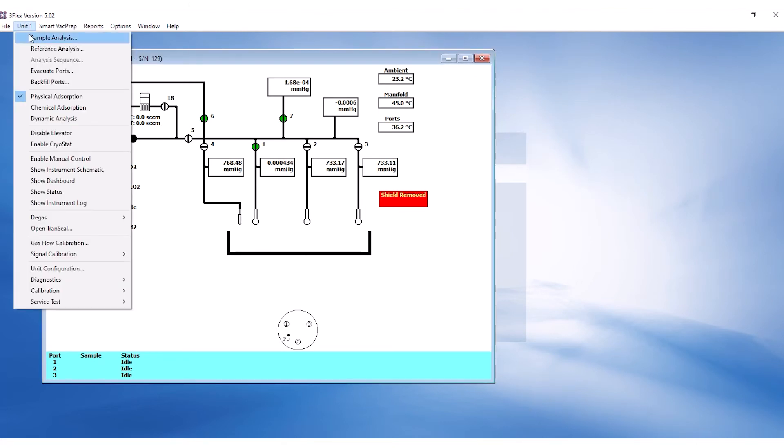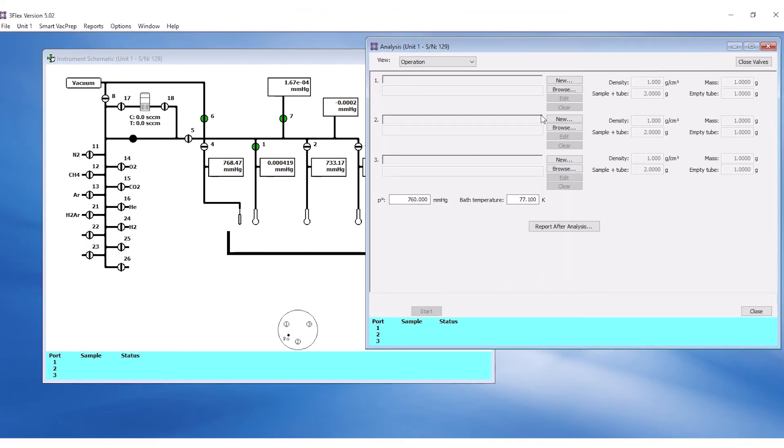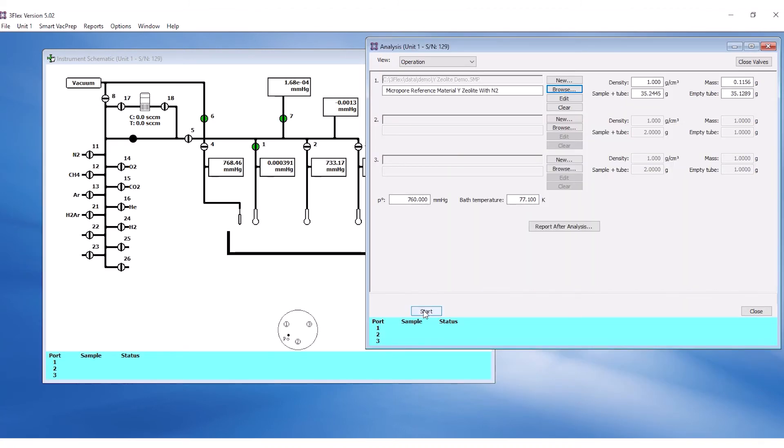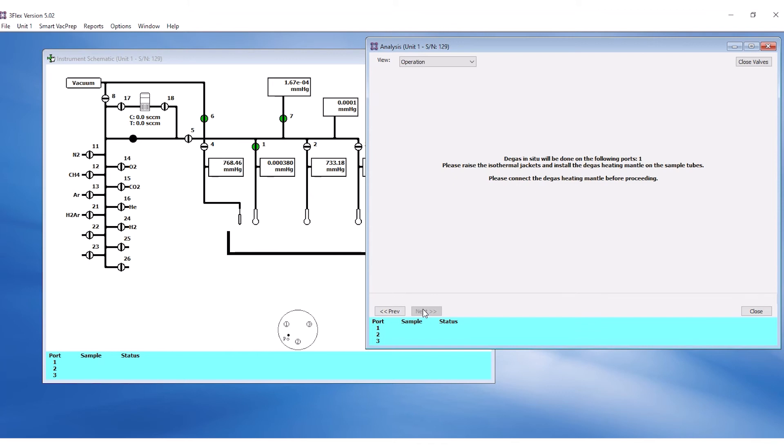To begin analysis, click on the unit menu Sample Analysis. Load the correct sample file for each port and click Start. Since degas in situ is selected, the software will instruct to install the heating mantle at the start of the analysis.